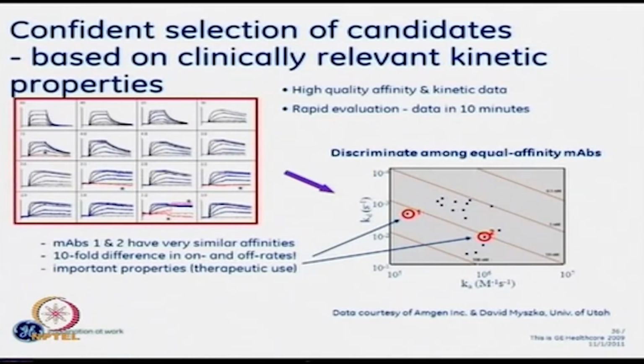So this is a live example of where kinetics data is actually being used to capture information regarding K on and K off and then make a more educated, knowledgeable decision on which MAB to go forward with. I think it's very interesting because if you just rely totally on the KD values, and do not look individually at the K on and K off... Yes, so distribute that KD value into K on and K off and make a more knowledgeable decision. So it was a very interesting example to appreciate the power of kinetic analysis.